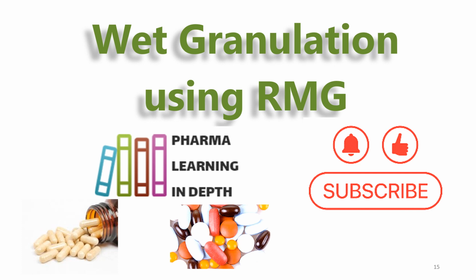Sometimes the API is required to be dissolved in a solvent like water or organic solvent, and then that solvent is added onto the dry mix. By this method you can have good distribution, good content uniformity, a homogeneous blend, and also good dissolution as required.